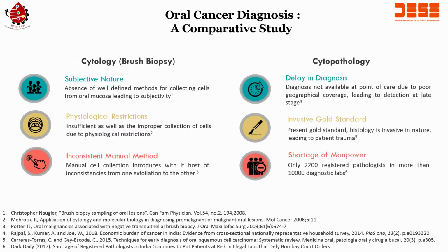Now, you have seen both the videos, right. So, what we have to see now is, let us compare if you are given a cytology, that is brush biopsy, versus cytopathology, and how comparative studies look. Okay. So, if you see the slide, if you compare the cytology versus cytopathology, these are a few of the papers.